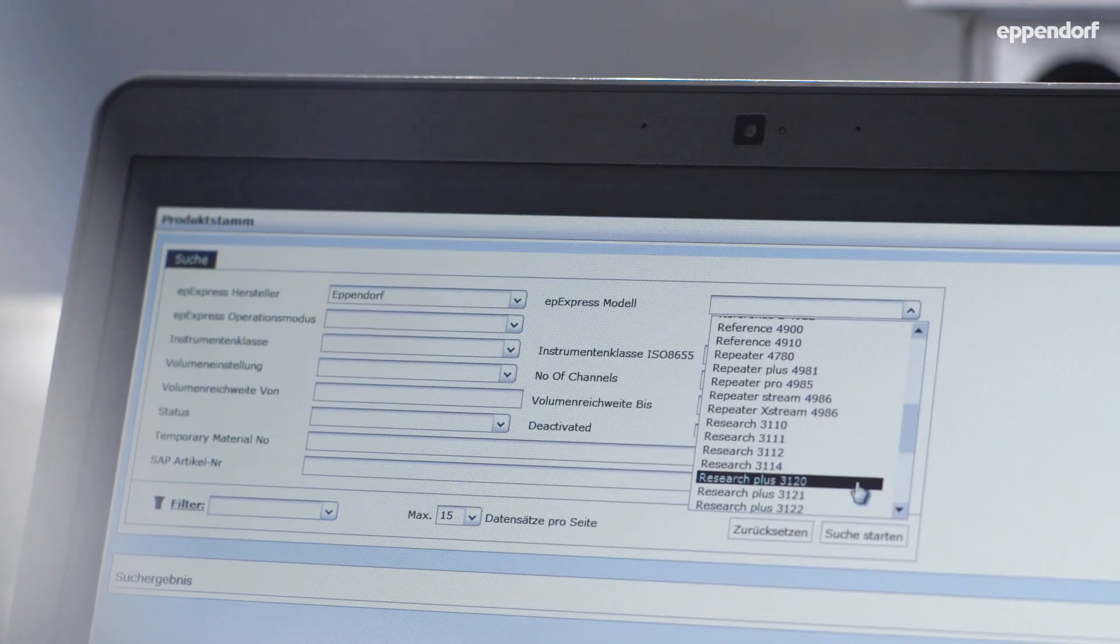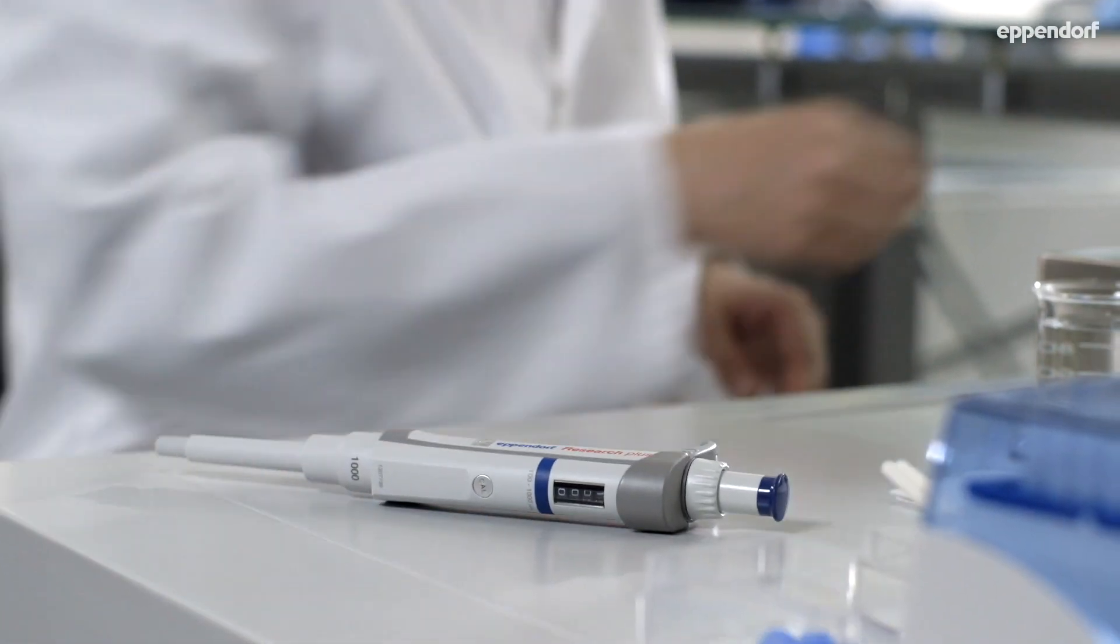In between professional service, we also recommend checking and cleaning your pipettes on a regular basis.